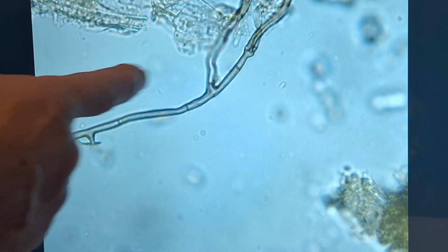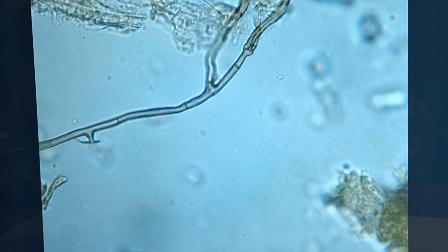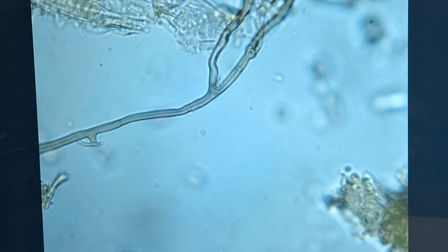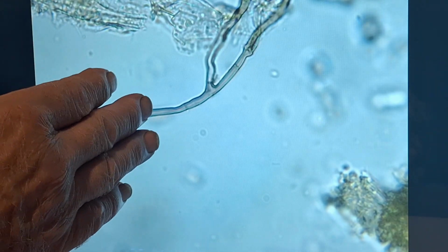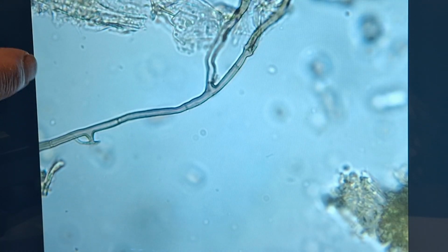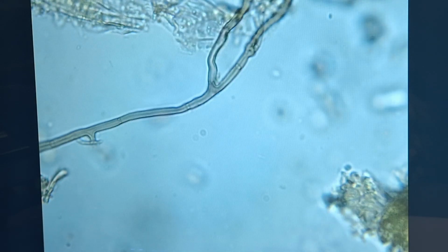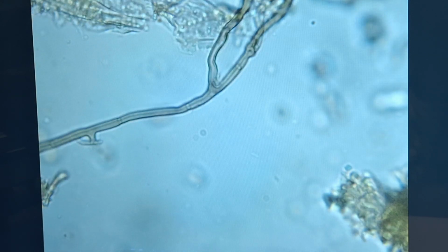And above it, there's a real nice piece there. All the septa breaks in it. So we can see it's a nice darker color. We like to see a more darker color generally. And nice breaks in there. There's septa breaks, each of those being its own cell. And we like to see lots of branching as well, showing it was probably a nice network of it. So that's going to be most like a saprophytic fungi, a decomposing fungi.